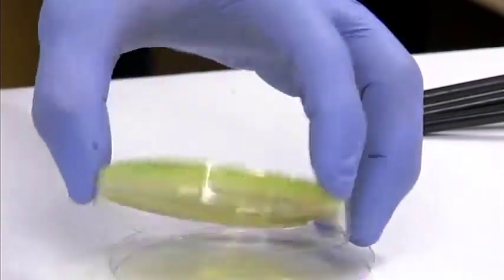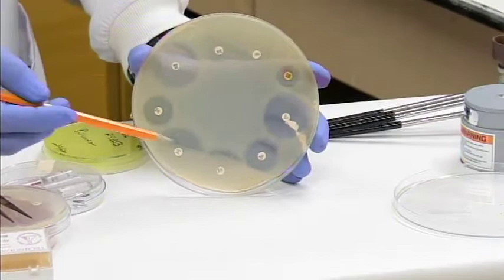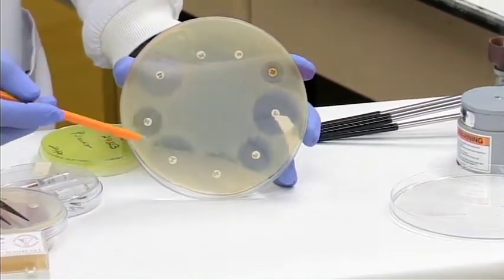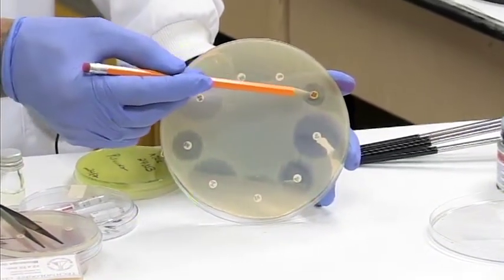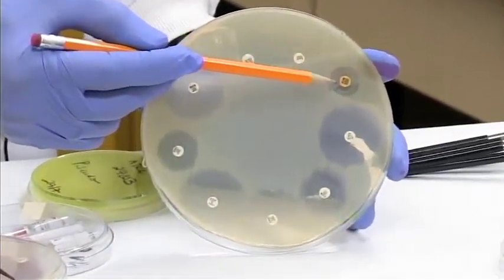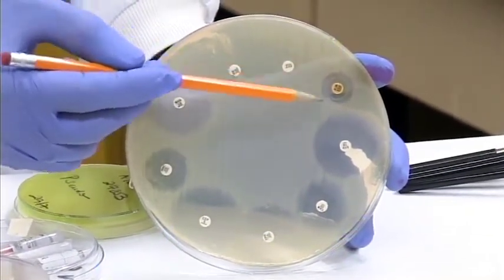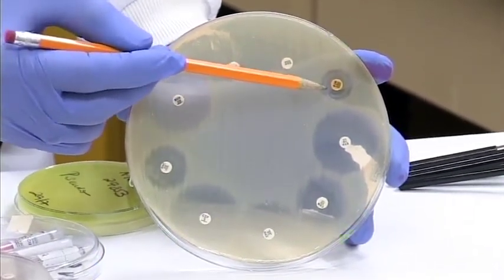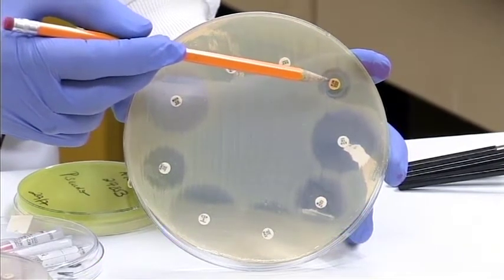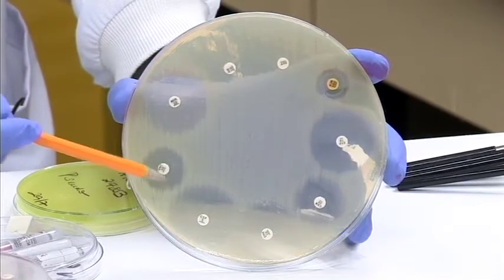So I'll show you a larger plate now with a similar effect. Here we have another plate. Again, you have several antibiotic discs. Most of them you can see zones of inhibition, clearing around them, whilst this one here, you may see no zone around it. So this drug was ineffective against this pathogen. You have no zone of inhibition around it. The bacteria grew all the way up to the disc, and there was no killing effect. Whilst the others have zones of inhibition or clearing, indicating that the drug was effective in killing that bacteria.